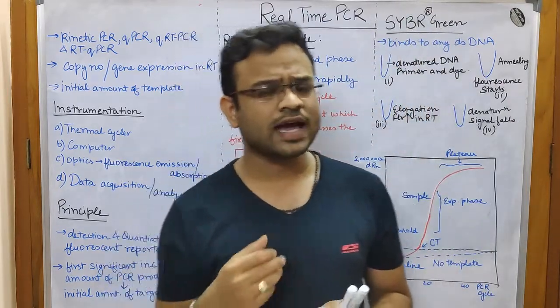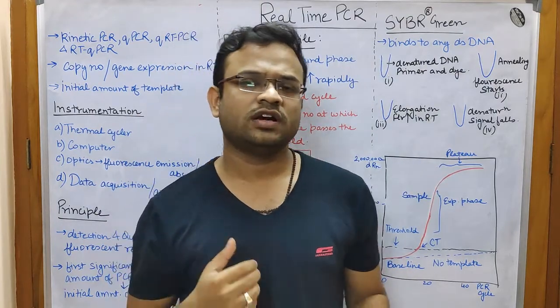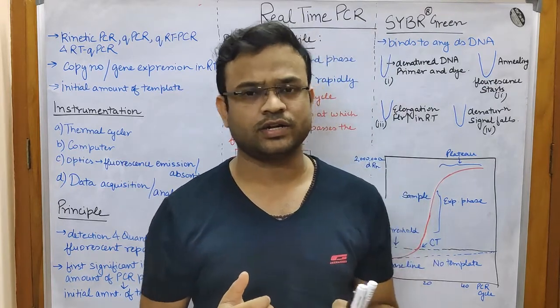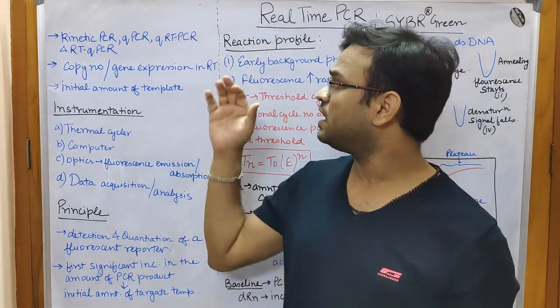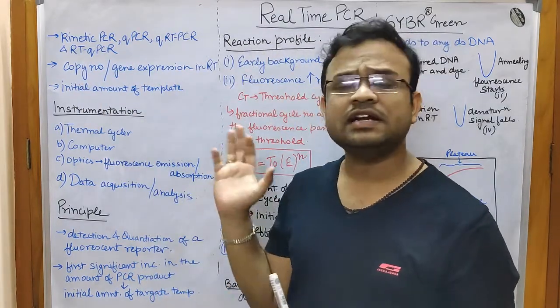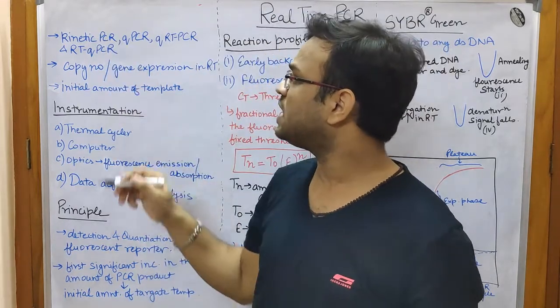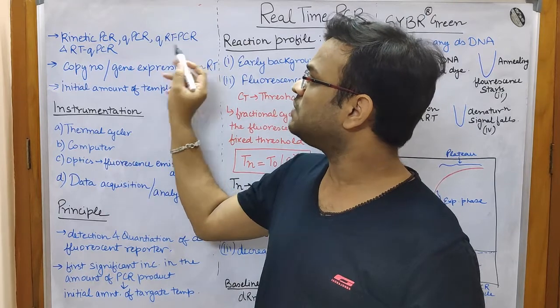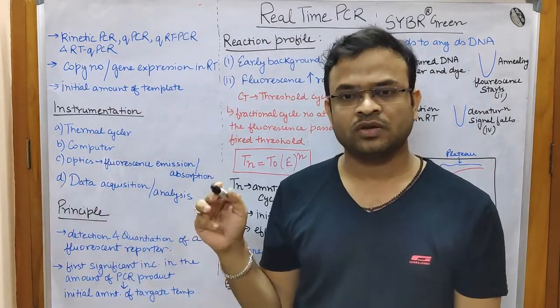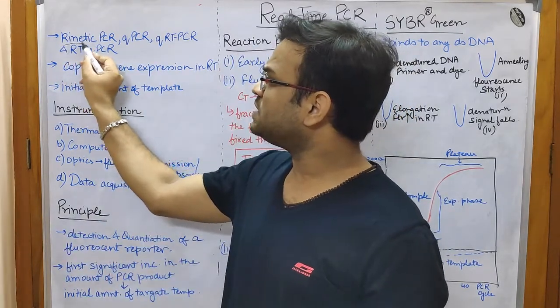As always, I have divided my lecture into the following points, and we would deal with each point in detail so that you can understand this in a better way. So let us start with the first point. It says that real-time PCR is also known as kinetic PCR, qPCR, qRT-PCR, RT-qPCR. These are the names of real-time PCR. Now why is this called kinetic PCR?